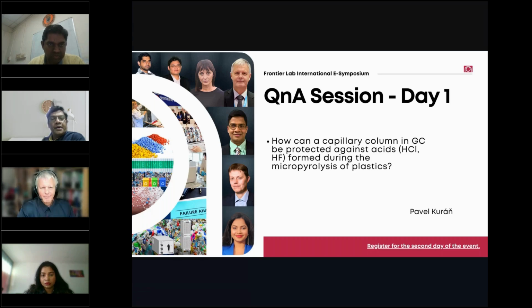Michaelson, do you want to answer this? I heard this kind of question several times. But now that is the advantage, that having very small sample amount, as far as I am aware of, there is no concern that if you are analyzing PVC and HCl, the system or the column will be deteriorated by these compounds. It comes up quickly but I think that is not a big issue for us. Mainly because we are handling small samples, but again, it has to be watched, so we cannot take it for granted. But mostly we do not see this as a big issue, because we are generally using a very small amount of sample, and wherever we require, we can also play with the split ratio to minimize the impact. But it has to be watched absolutely.